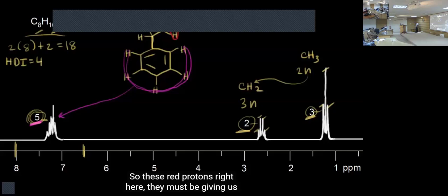Otherwise, you would exactly see a doublet of an ortho-coupled proton or meta-coupled proton. Right now, you have 5 protons, and all these protons are either ortho-coupled with each other or meta-coupled with each other. So coupling is there, but there is no substituent in between, so definitely they appear as a multiplet. You understand ortho coupling, right? The 2 protons on adjacent carbons, vicinal carbons.